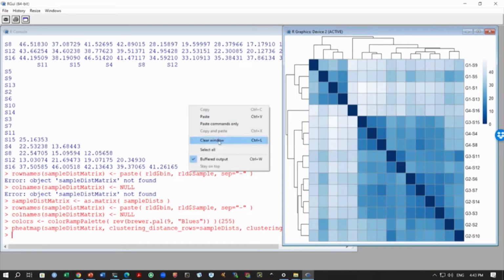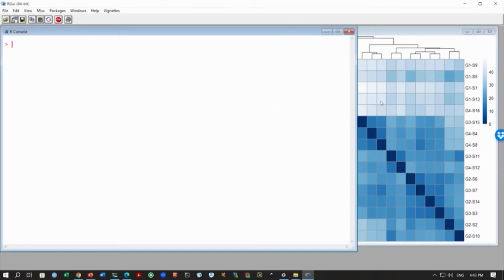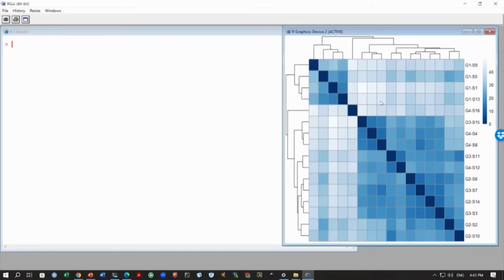One of the things I wanted to mention is that we used Euclidean distance. First we did something called an rlog transformation, and then calculated Euclidean distance between the samples. What does the rlog transformation do? It reduces variability, as we saw in our data, for the genes that have low read counts. So, in that case we can use Euclidean distance.